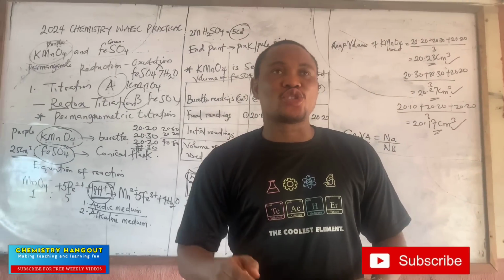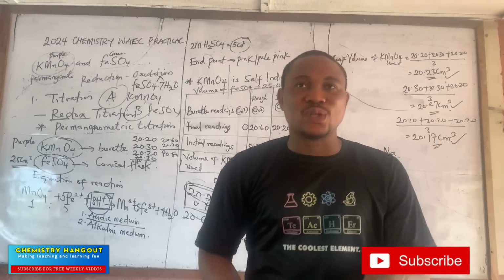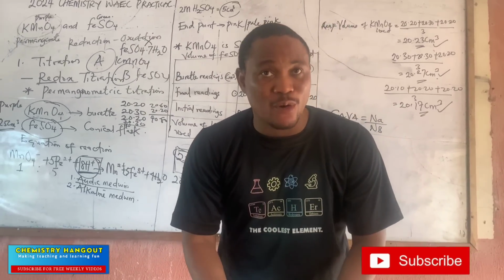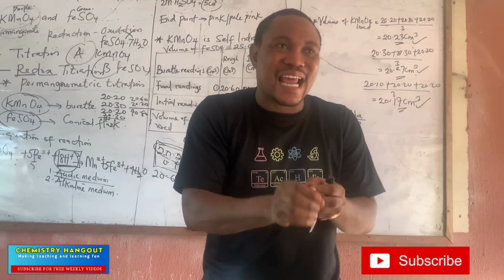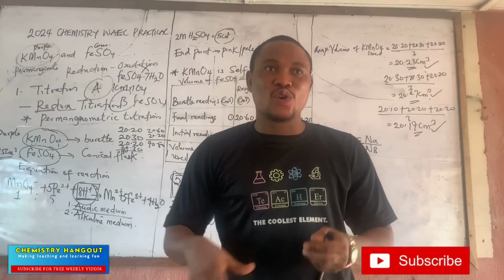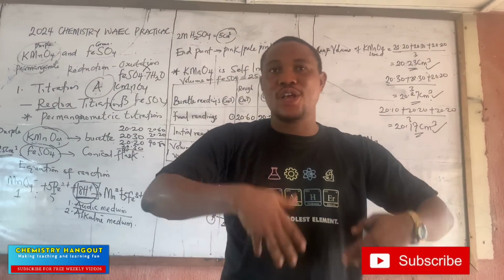In the instructions, you see a lot of reagents there. There is methyl orange, phenolphthalein, silver nitrate, potassium dichromate. You might not use all of these for any test this year. So you as teachers are the ones that will select the few that will be significant to the practical we want to carry out. Like silver nitrate, I'm not sure we're going to use it this year. It's in the instruction, but we're not going to use it.